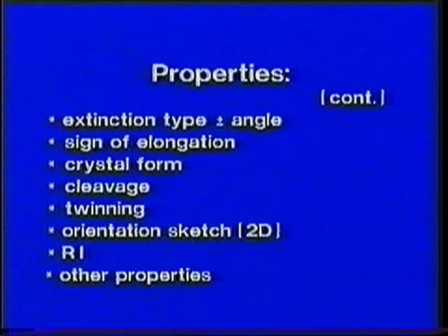Look at most grains to assess crystal form, cleavage and twinning. Other features such as inclusions and associated minerals may be important. Finally, use identification tables to identify the mineral.